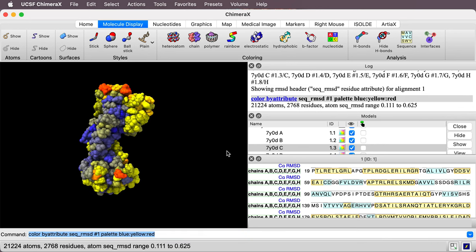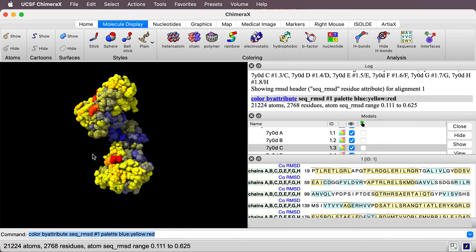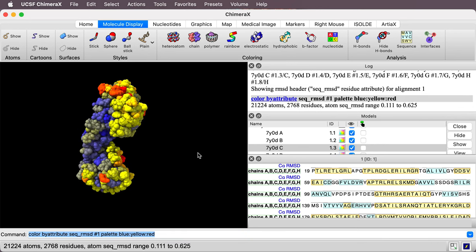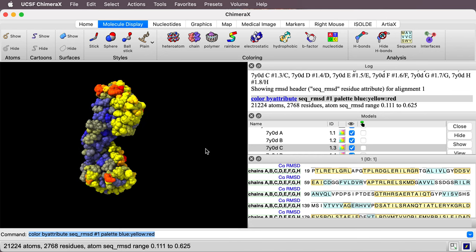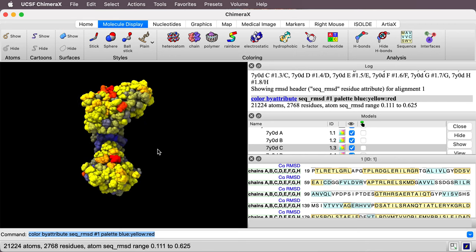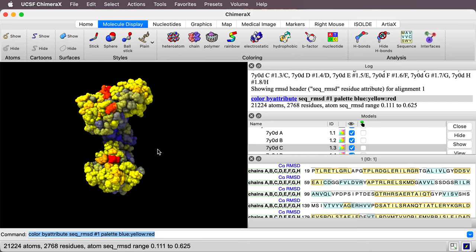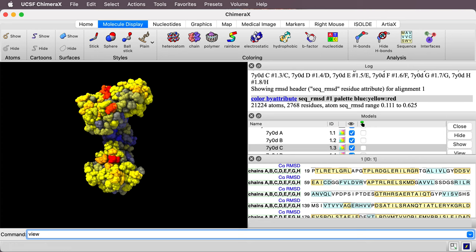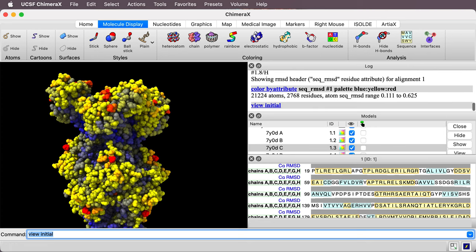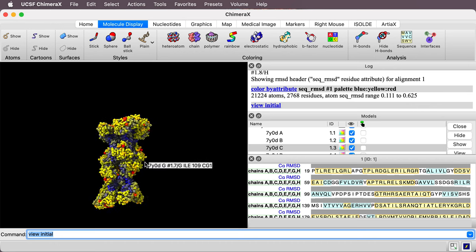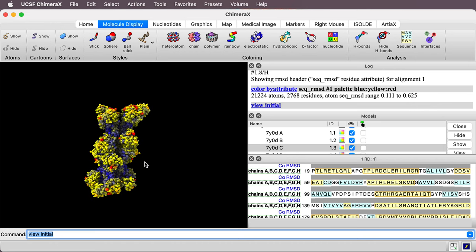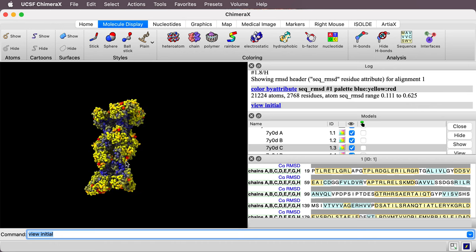All right. So there's the coloring where yellow and red are the ones that have more variable C-alpha atom positions. And now how do I get back to the original arrangement of the eight proteins? I say view initial. And that's what we were looking at at the beginning.